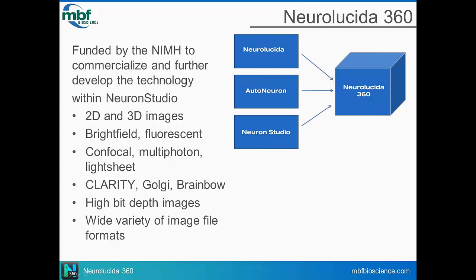We also work with high bit depth images. So if you are working with a camera, or after deconvolution, you've got 16-bit image data, you no longer have to downsample that to analyze it. We work with that, as well as a wide variety of image file formats.